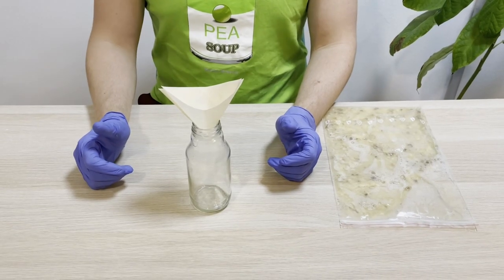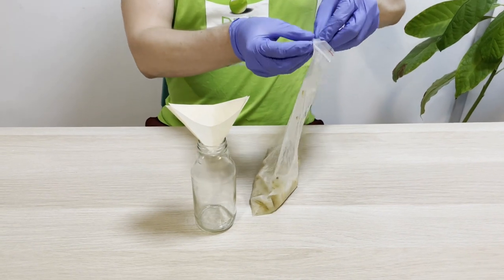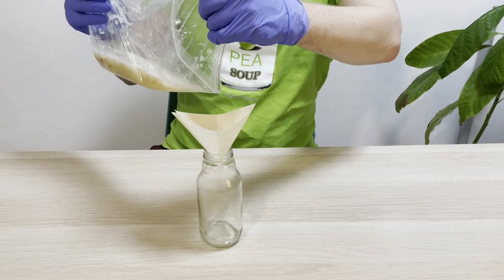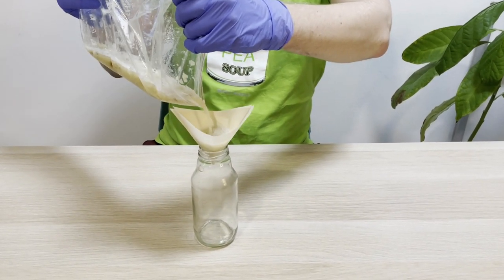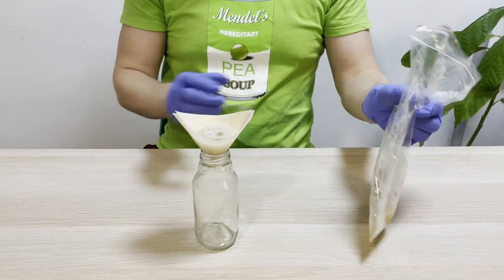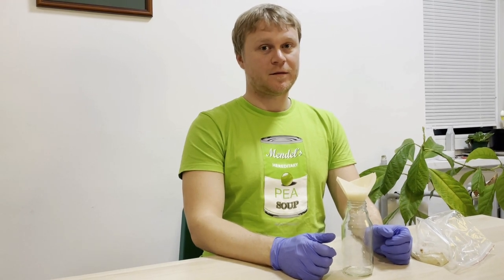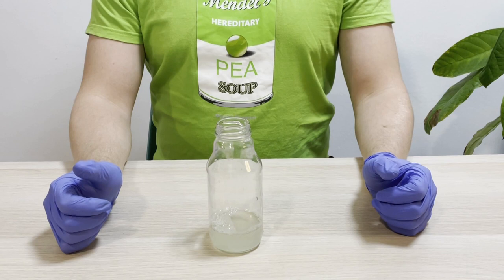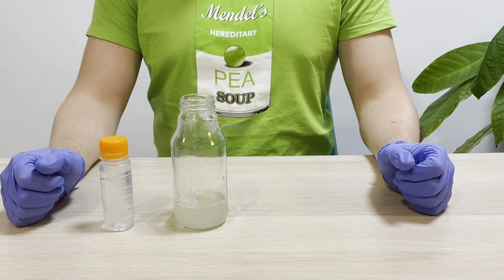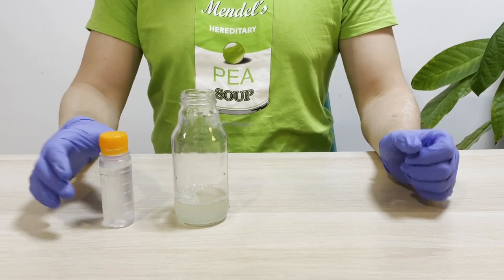Let's filter the mixture into the bottle in order to remove large particles. Keep in mind that filtration may take several minutes, and probably you will need several filters. Now that we have this mixture, we need to extract DNA from it. In order to do this, gently add ice cold alcohol and try to layer it over the previous solution.